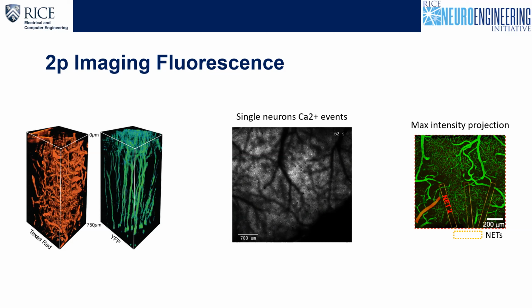It's in both, because as I said, if there is a brain disease, it takes long to develop. And if we want to study how the neurons are behaving, we really need to electrically record. So that's the good thing about this multimodal acquisition system, that we have all of these modalities simultaneously. So we have all the information, all the data that we need to understand the brain with this setup.